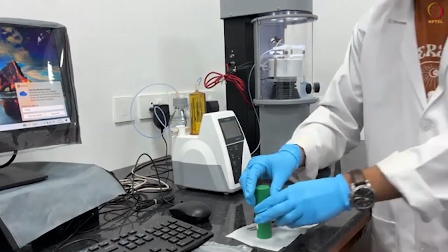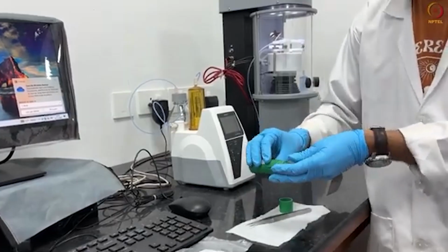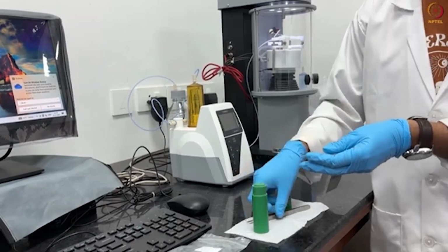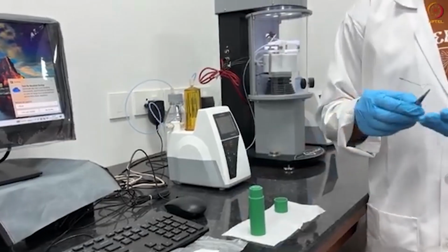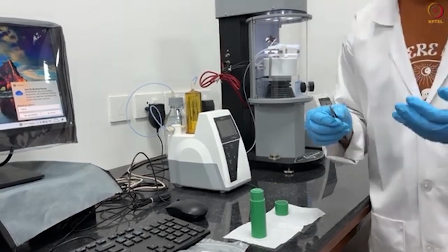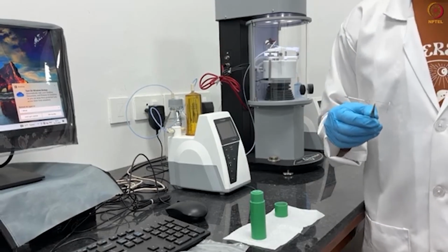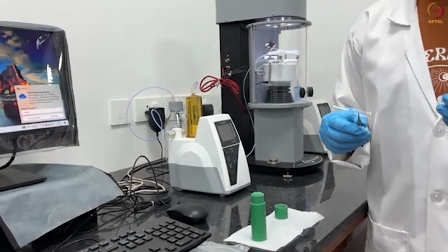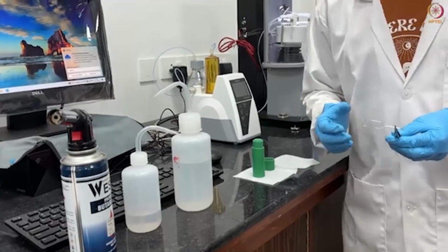As I have mentioned earlier, I am using the Du Noüy ring. This ring must be cleaned properly. Always ensure that if you are using a plate or ring for any geometry in the force tensiometer, it is thoroughly cleaned. If the geometry is not cleaned or contains contaminations, the measurement will vary. Let's see how to do cleaning.